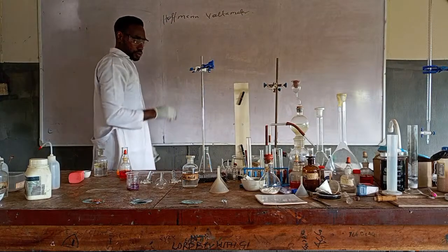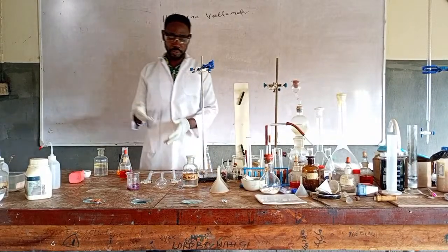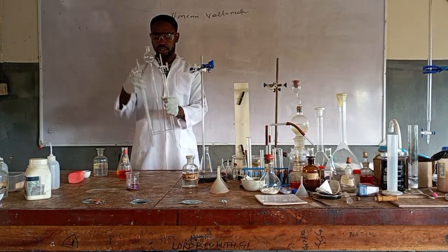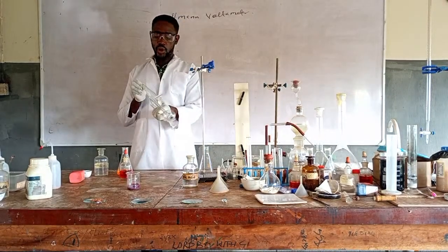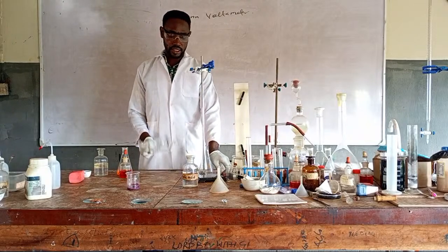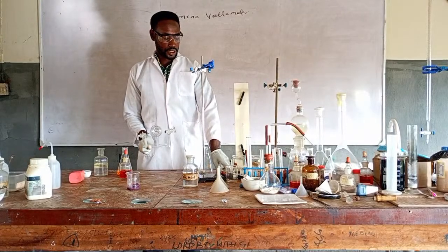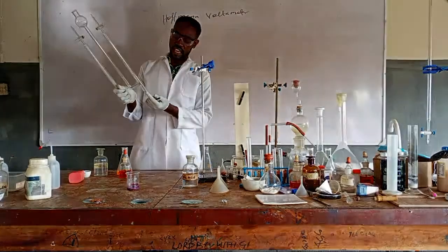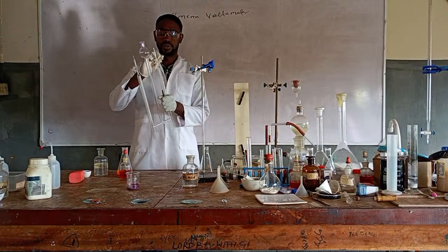So, it's used to carry out electrolysis of acidified water and also other liquids that liberate gas. It's made up of two collecting tubes here, and here is the jar, the reservoir. This is where we fix the electrodes. In your SS2 you will know more. This one is actually the fake one. This is Africa, so I have to improvise. The ones sold here are just for fancy, they never knew it would be used.